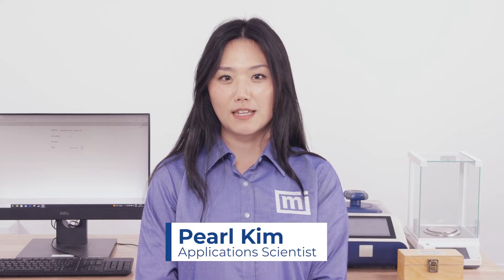Hello, my name is Pearl. I'm one of the application scientists here at Micromeritics. Today we're going to take a brief look at our new AccuPIC gas pycnometer.